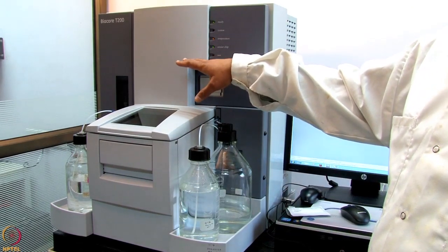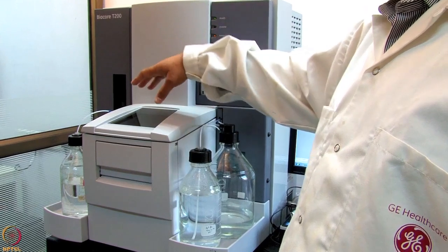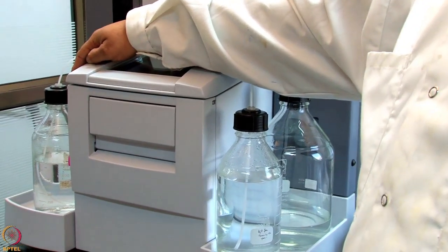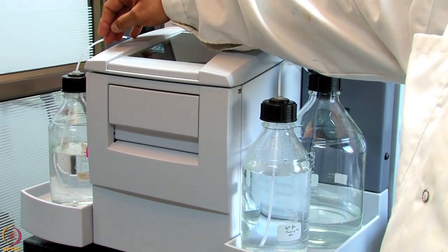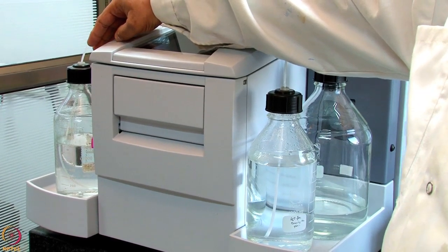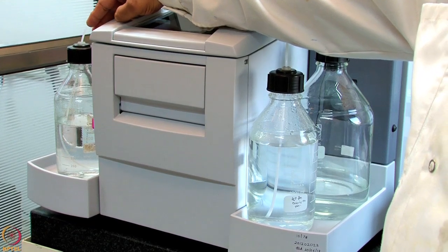So this is a surface plasmon resonance and it's a Biacore T200. So this machine has the various parts, like the running buffer is connected here, and any of the biological buffers can be connected as a running buffer. They could have any pH from low to high. So the regular buffers used in a Biacore experiment are HBS-EP, HBS-N, PBS for small molecule experiments.